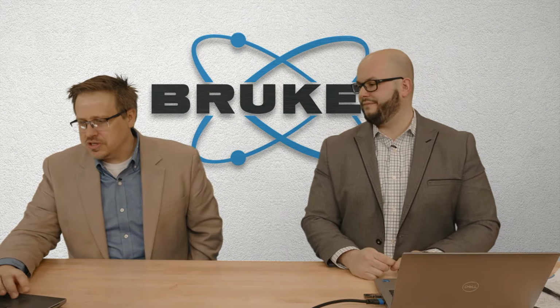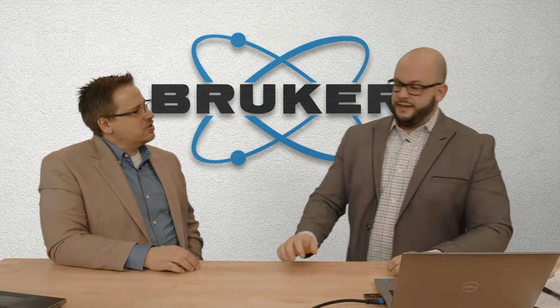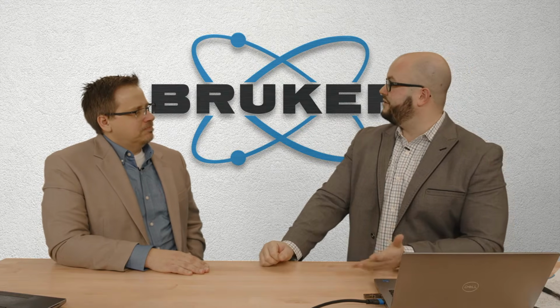Now, we've got a few other questions that came in from Adam. I work with exotic alloys. Where can I find the modulus and Poisson ratio? It's a great question. If it's a novel alloy, you can probably get it through some other means.